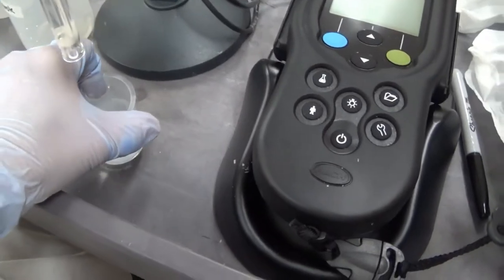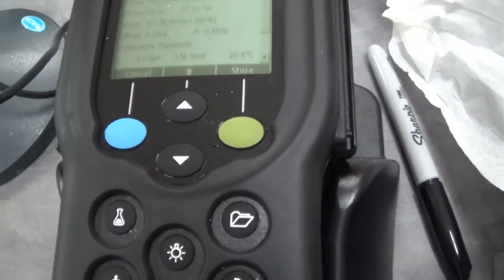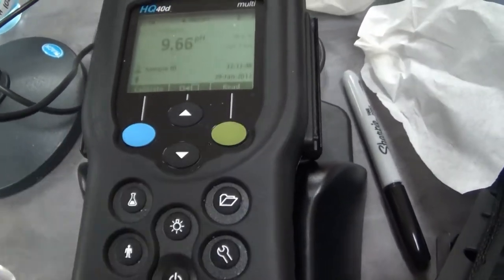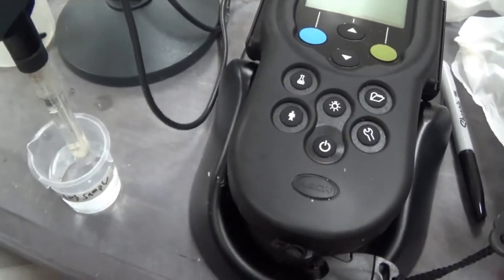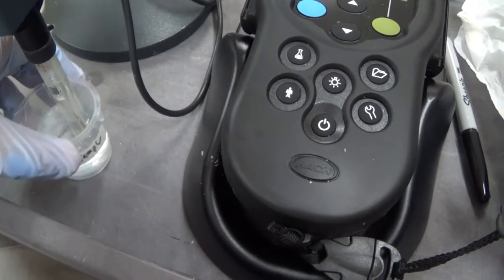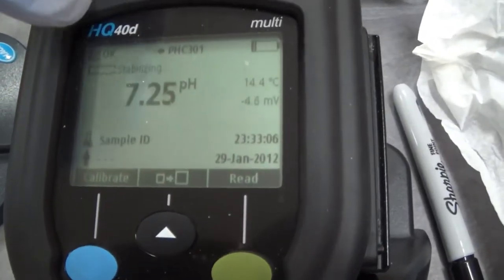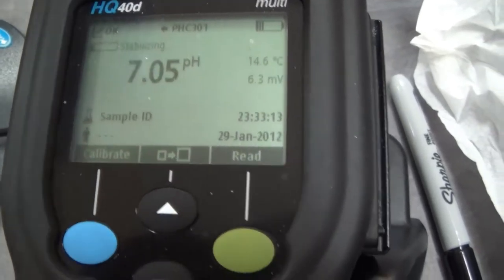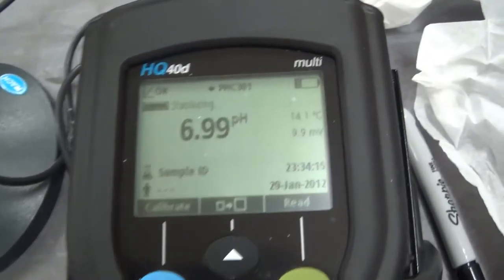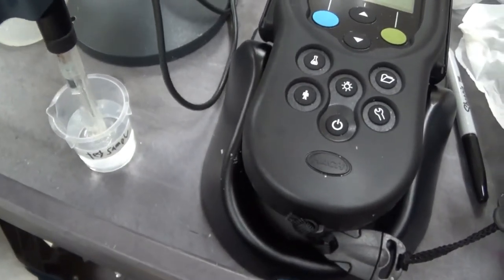I rinsed it, blotted it dry. Now I am going to do my test sample. We are still on the calibration. Let's hit store. We are ready to do a sample. Put it in our well water sample. Hit read. Since we calibrated, we got a little curve up here. Seeing our calibration is okay. Our well water is finally complete. pH is 6.99. And that's our pH reading.